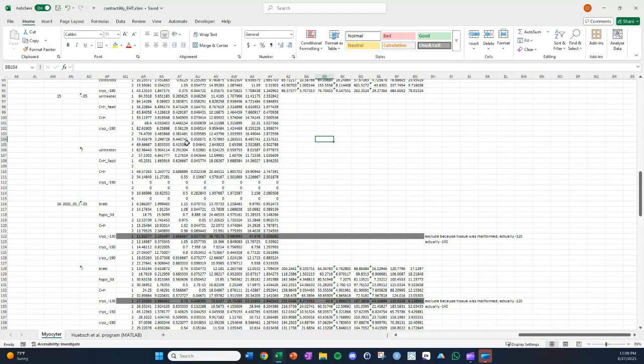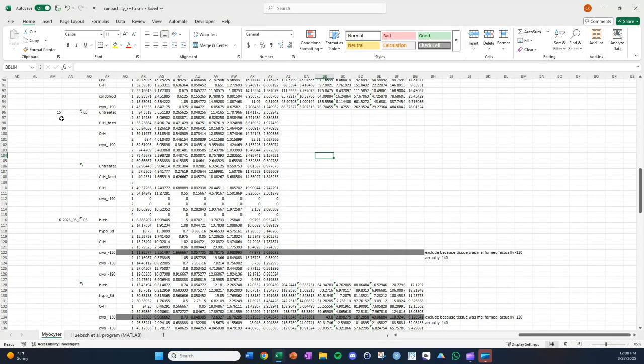This was the 15th experiment we did. And this is the section for the initial, so 1 hour before the treatment and then 7 days after the treatment. And you can see I've already pasted in all the conditions except what I just analyzed. So I'll go ahead and paste that in here.